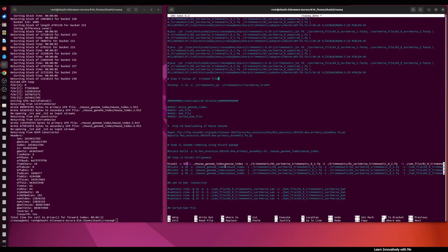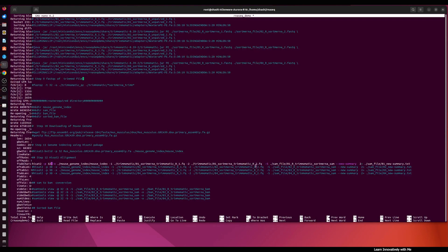The file is present but we reference it as mouse_index in the command. The next inputs are the FASTQ files for read 1 and read 2, specified with -1 and -2. These are in the Trimmomatic directory — the trimmed FASTQ files for read 1 and read 2. Next is -S, which is the output directory for the SAM file — that is the Sequence Alignment Map file that will be generated. We also direct a summary output to the SAM file directory.